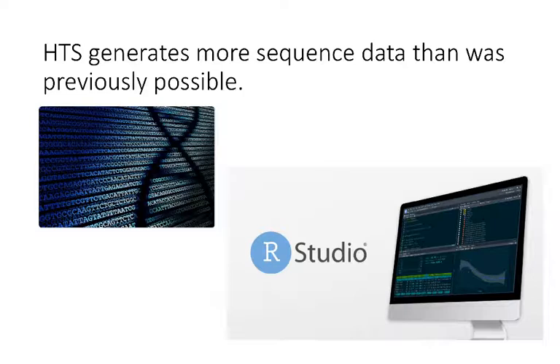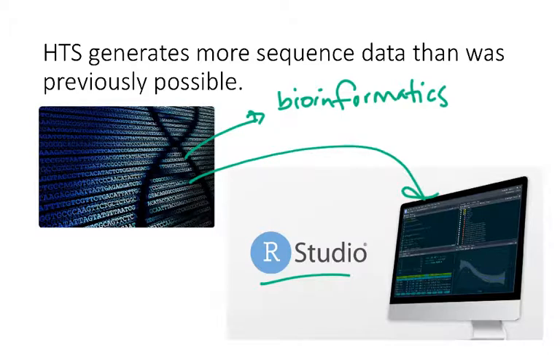And because of that, you need to use techniques that are called bioinformatics, which is basically computer data analysis that has to be done with that sequencing data to be able to make sense of it all. We'll talk a little bit more about this later in the semester. There's also a course that Dr. Visker teaches here, specifically focused on bioinformatics if you're interested. But the idea is that because you're generating so much data, you have to use specific computer programs, such as packages within RStudio, to analyze all that high throughput sequencing data. So that's one of the reasons why our labs this semester are focusing on teaching you how to use RStudio and analyze data in RStudio. That's really because that's the direction this field is going. So if you're able to put on your resume that you know how to use RStudio, it will make you more competitive for jobs.